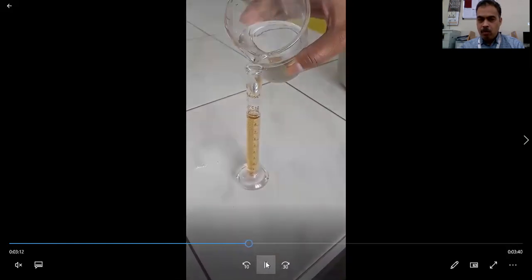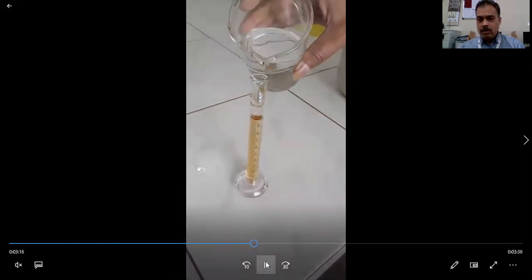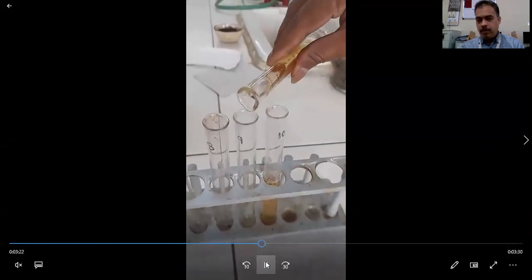Whatever number is mentioned on the test tube, that many ml of filtrate will be added. So in test tube 9, we'll add 9 ml filtrate, but in every test tube the total will be 10 ml, so we will make up the volume by adding water. So 9 ml filtrate, and now 1 ml of normal water to make up the volume to 10 ml. So now this is 10 ml.